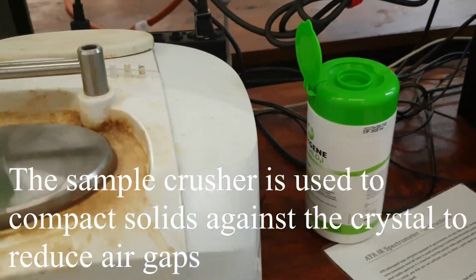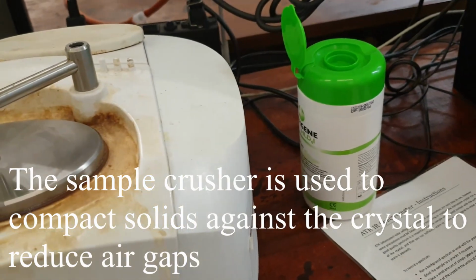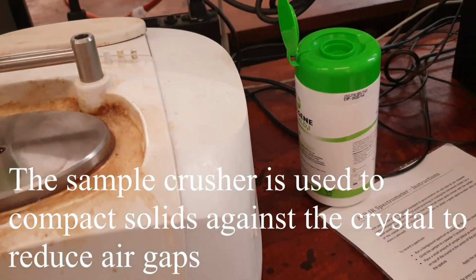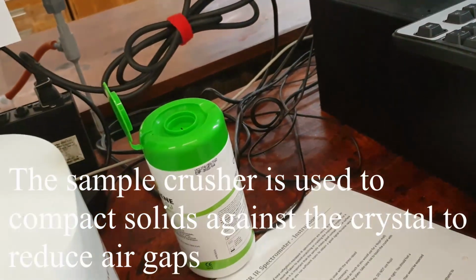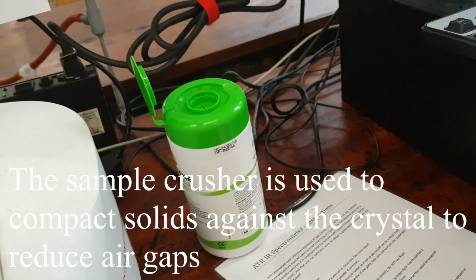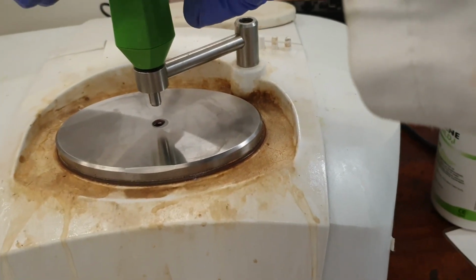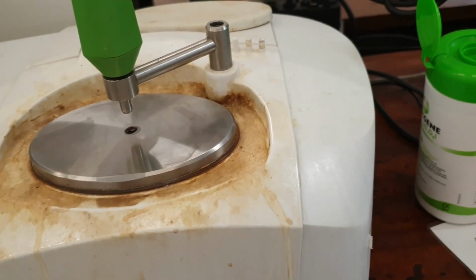Turn it over. What do you want? How else are you gonna do the scan? Mate, Eugene, you don't need this if it's a liquid. It doesn't matter where it is here. It does. Because the infrared gets refracted through the crystal and back into the machine anyway. So having that above it doesn't do anything. It literally doesn't do anything. Anyway.